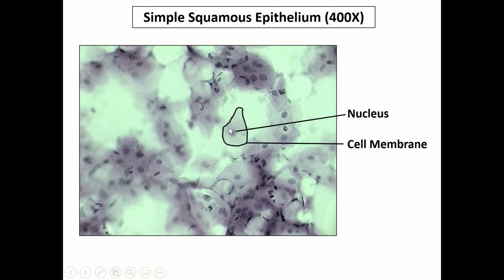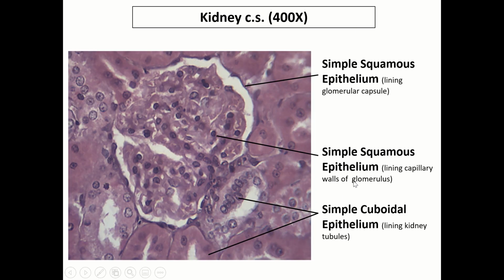The nucleus in these cells looks very nice and round, but it could be oblong or oval, depending on what kind of tissue you look at. When you look at a second slide for simple squamous epithelium, you're going to be looking within the kidney. And when you focus primarily on the outside of the kidney, you're going to see structures referred to as glomeruli. Now, these glomeruli are balls of capillaries. And if you're reading your description in the lab manual, you'll find that simple squamous epithelium helps with diffusion across capillary walls. And so all of these are individual nuclei of single, simple squamous epithelial cells.